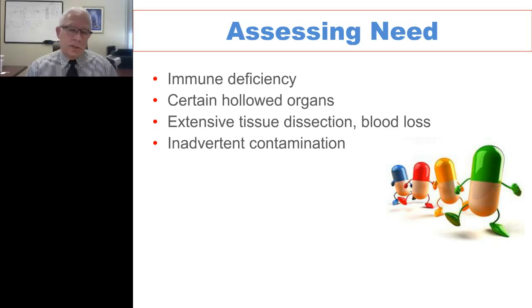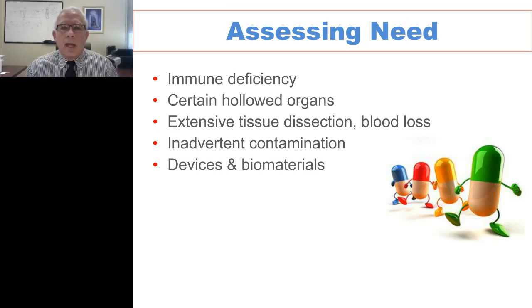If there's, for example, an inadvertent contamination during surgery, well, definitely antibiotics may be needed post-op. And if you're using devices and biomaterials like catheters, your chances of infection because of the materials that you're using could increase 1,000-fold. So maybe pre-op antibiotics may be necessary, and in some cases, even post-op antibiotics.